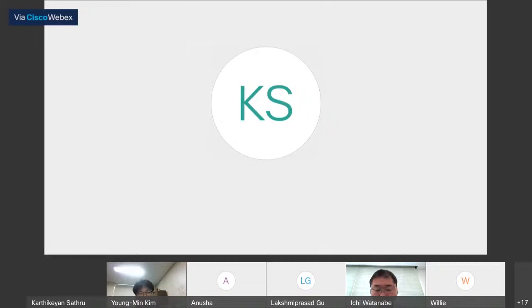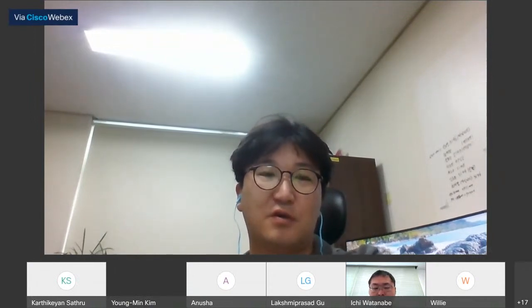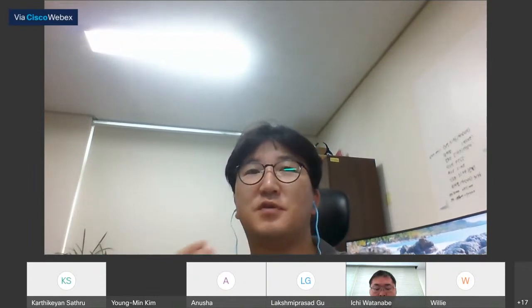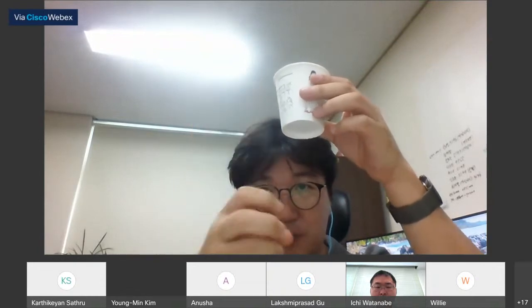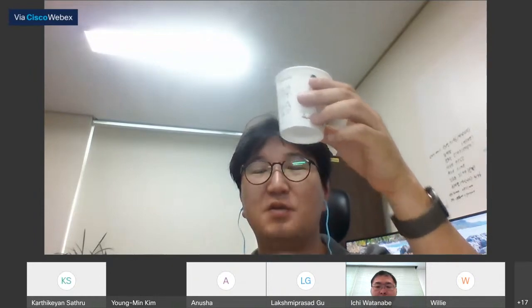Okay, I will say, basically the residual solid remains in the sample cup after the reactions. So contamination by the solid does not happen in our system, in the second reactions. However, the problem is some kinds of condensation reactions. At the first time, in the sample cup, the light component is generated. However, during this atmosphere, condensation reactions can happen, so some heavy components can be generated. In my case, these are also target components. It's not contamination for the catalytic reactions.